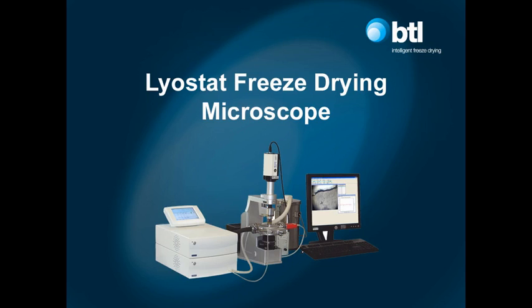The BTL Liostat is a freeze drying microscope used for determination of critical temperatures for freeze drying. In this video I will demonstrate how to load a sample into a Liostat for analysis.